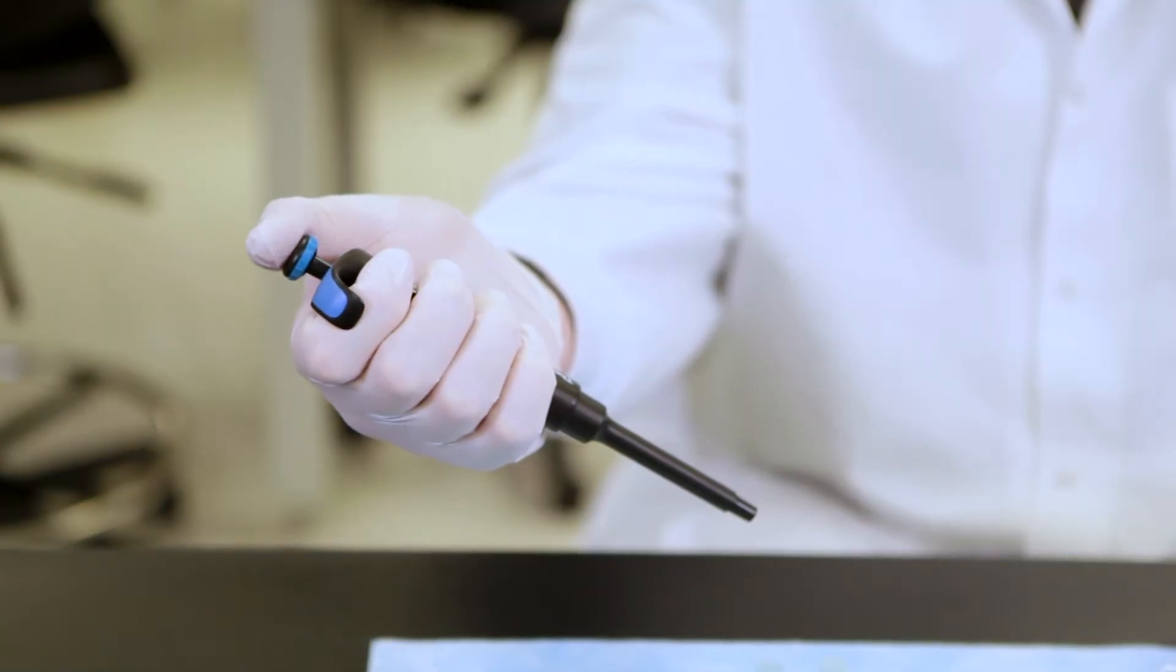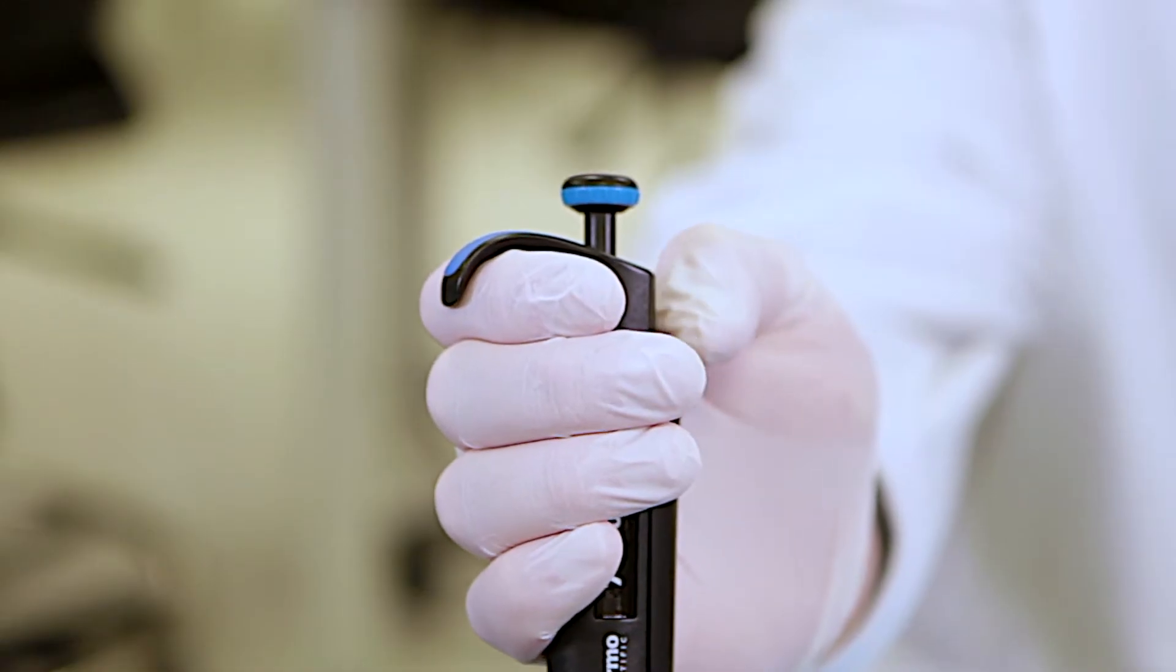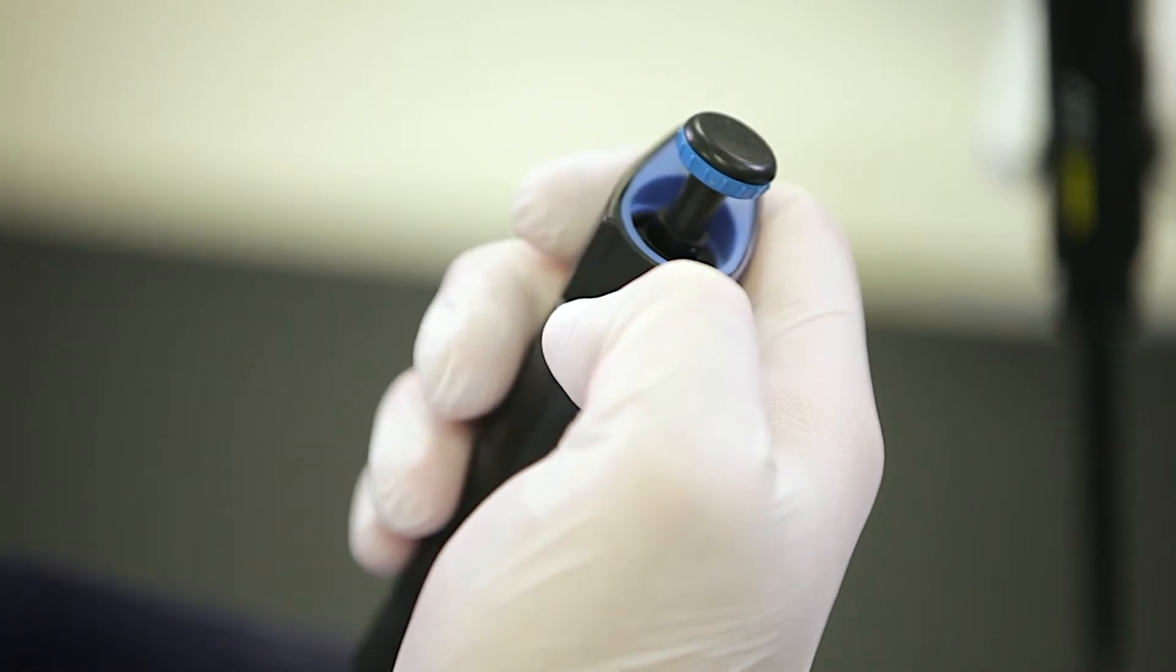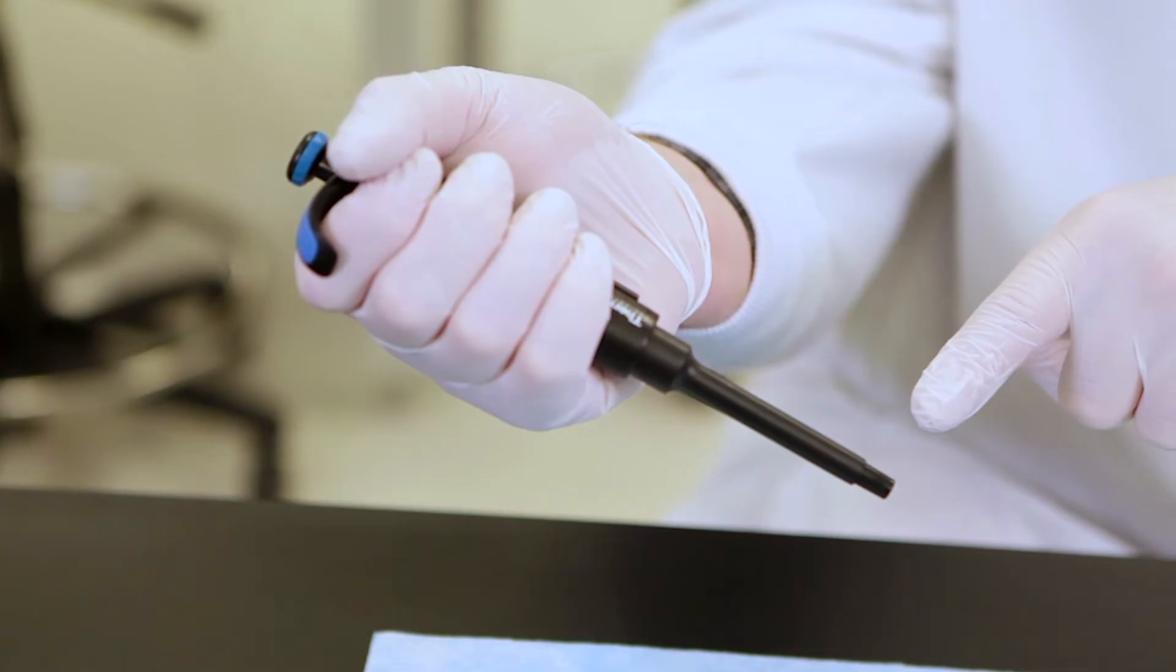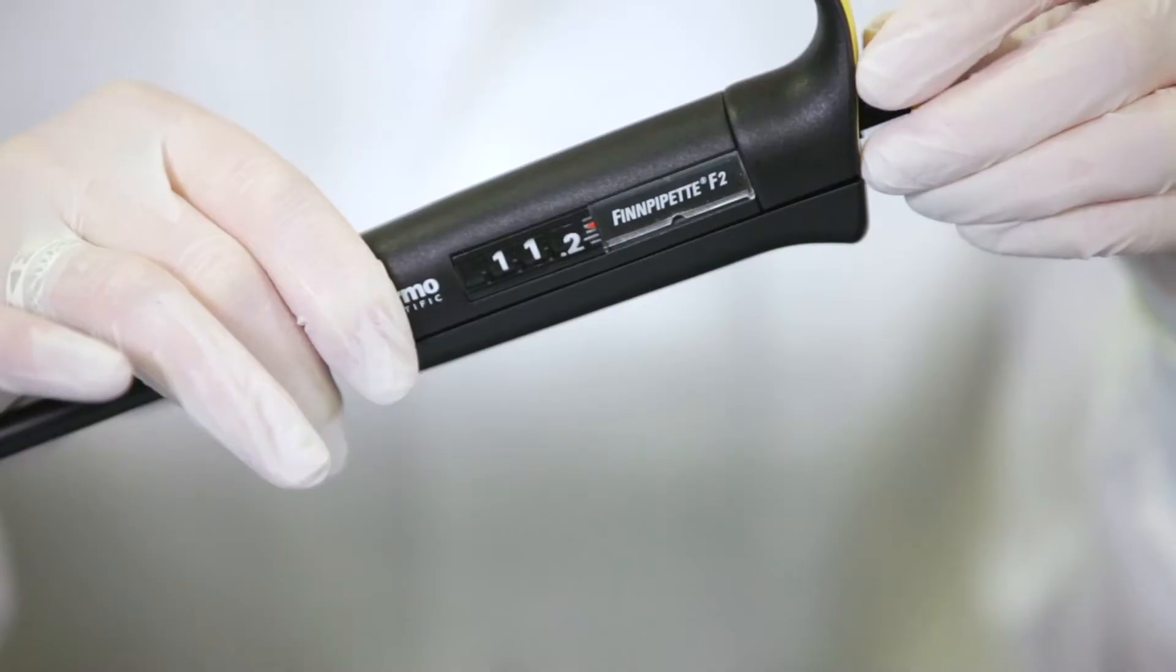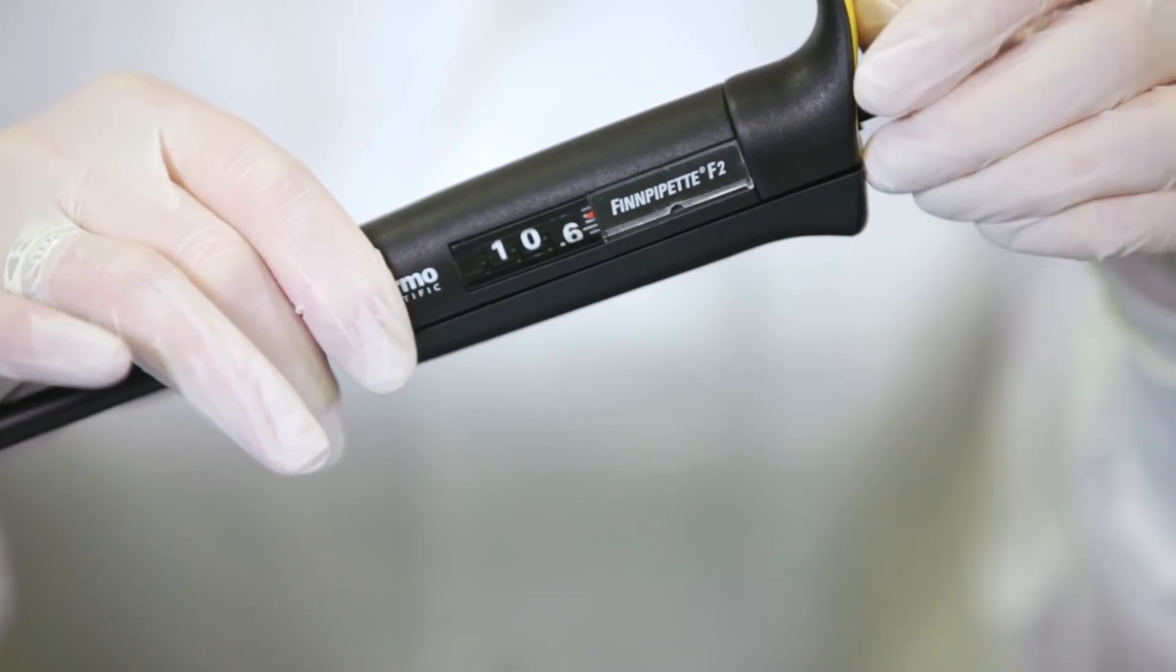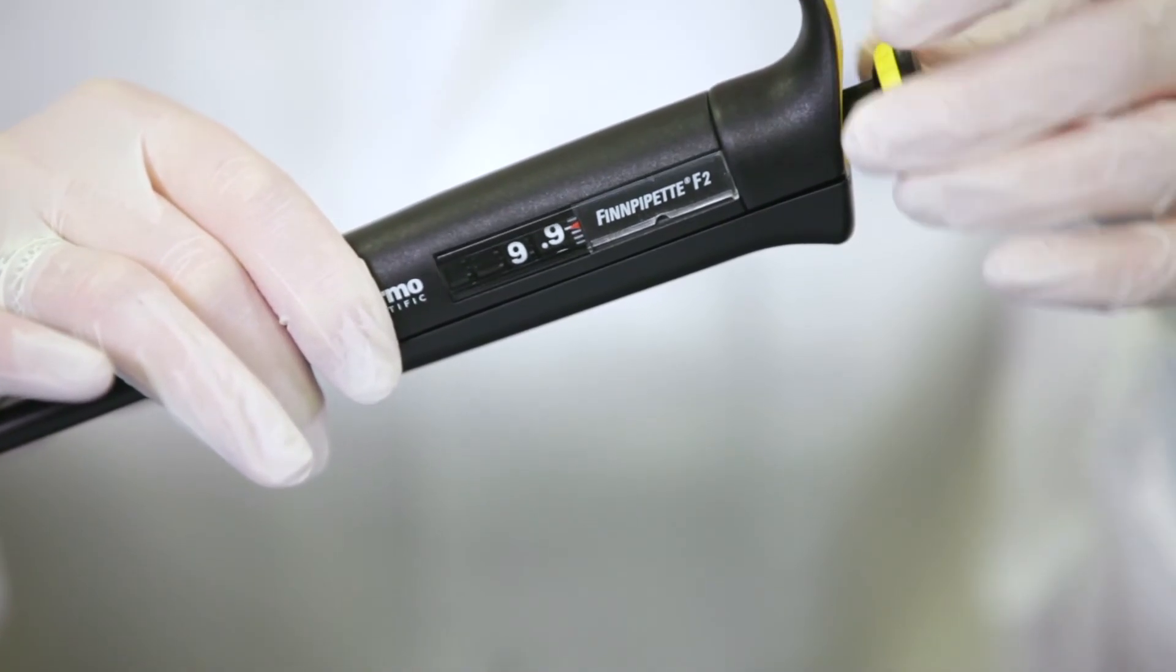The plunger: press the plunger to pick up and dispense liquid. The ejector button: press the eject button to release the used tip. The tip holder is where the disposable pipette tip attaches. The volume adjustment: turn this knob to set the desired volume. Volume indicator displays the volume of the liquid you will be transferring.